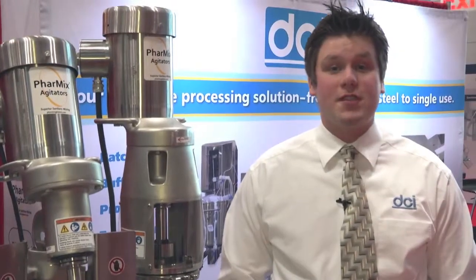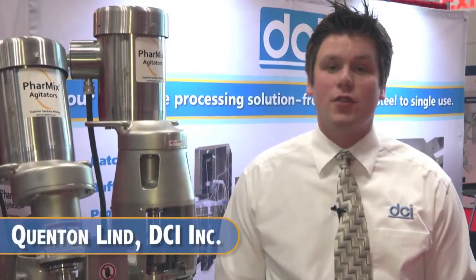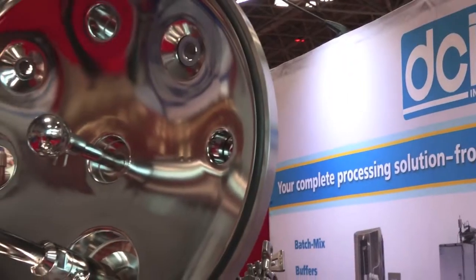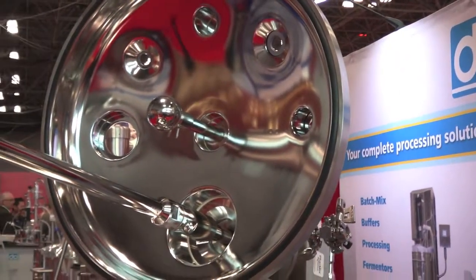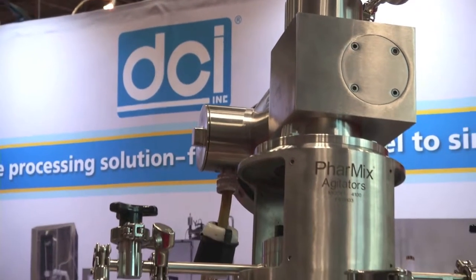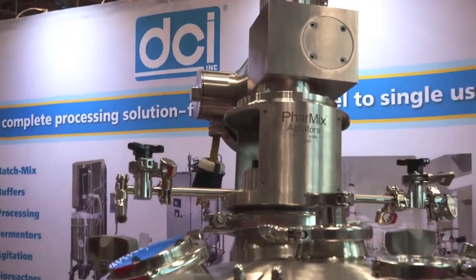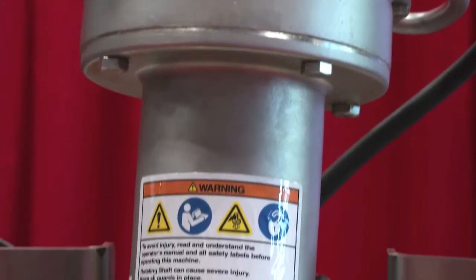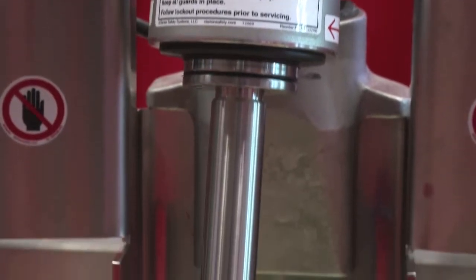Pharmix agitators are specifically designed for demanding pharmaceutical and biotechnical mixing applications. Pharmix has the industry's best performance and cleanability features, which include all stainless steel drives supplied by Stainless Motors Inc., inverter duty motor, reduction gear, and pedestal. The Pharmix lineup also utilizes SMI's Santa Fan Technology sanitary motor design, which offers a polished stainless crevice-free cooling fan.